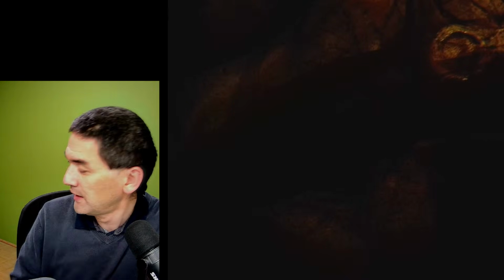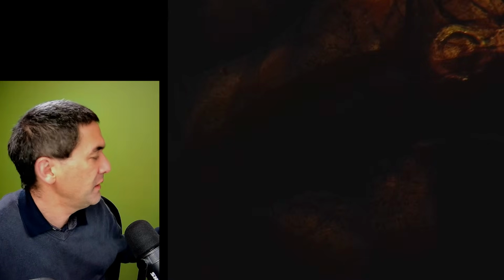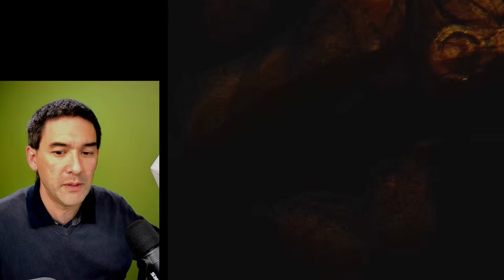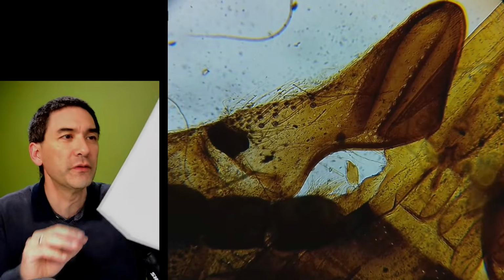Can you please show the box the German adapter came in? I've made one very similar, but not as clean as the one. Thank you. Yes. It's called Digi-Klemme. I have not found it on Amazon, but there was this, how do you say, German astronomy shop, and I think they're selling different versions of it.